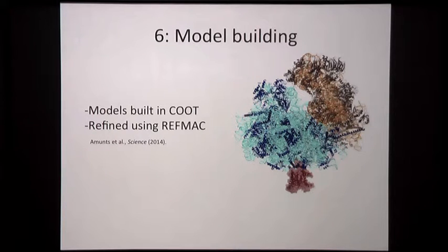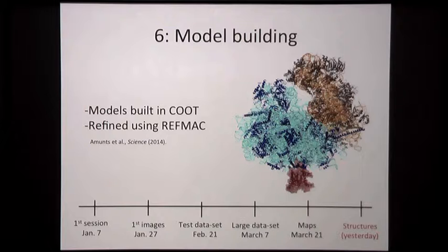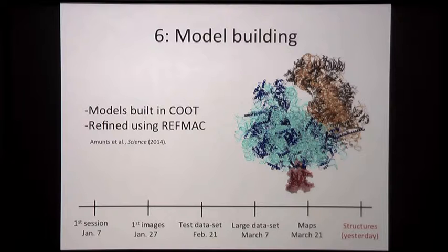And so if we go back to my little timeline here, I had my first microscope session in January, and as of yesterday, we have finally finished building the structures, and they have been deposited in the PDB. So this has all gone very quickly, although in large part this model building portion at the end went very fast because of a heroic effort by Israel to really build a really nice ribosome structure, because the ribosome is really, really big.